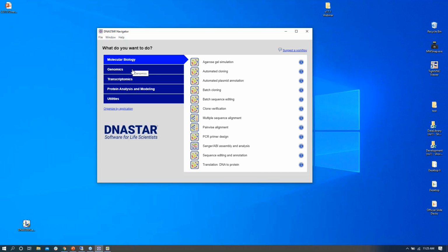Great. And then another workflow question: how does choosing multiple samples, or multi-sample, in a single assembly differ from choosing single sample? I think on the input sequences screen or in the assembly. Right. So when it's a single sample, the assembly is the same. It takes the data and aligns it to the reference. What's different is that if you select multi-sample, it will create those pseudo consensus sequences and allow you to group the reads to their respective samples. But the actual assembly of the data is the same.